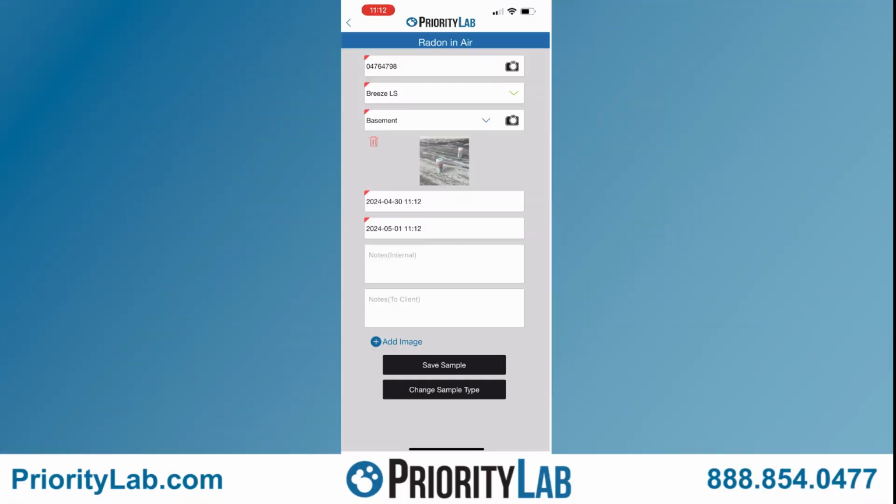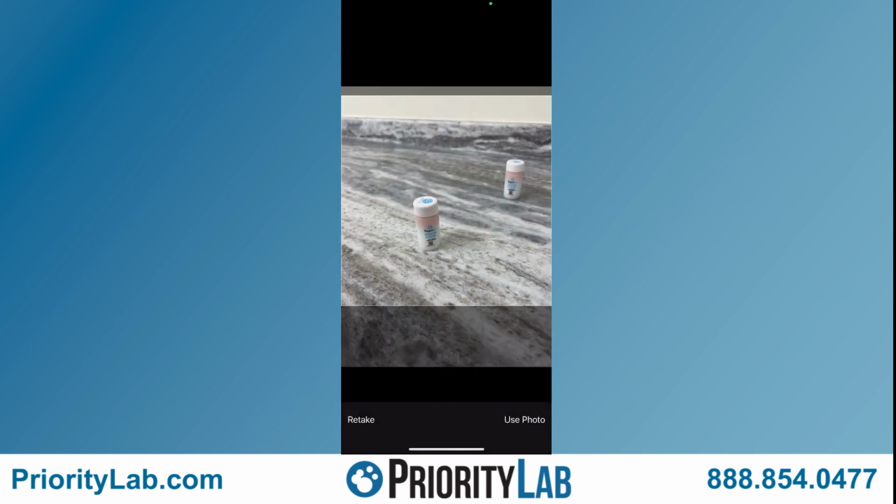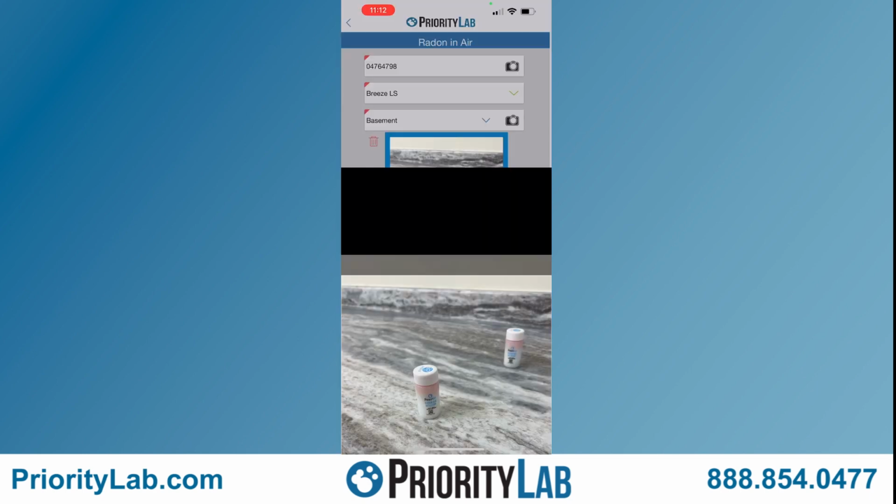As an option, we have the Add Image button directly above the Save Sample field. If you were to click this and take a photo, you can add an image description and either have this be included on the report for you or for your own personal records.